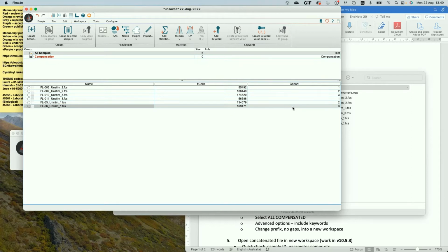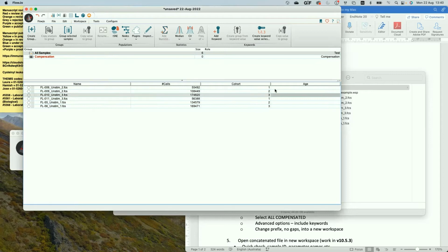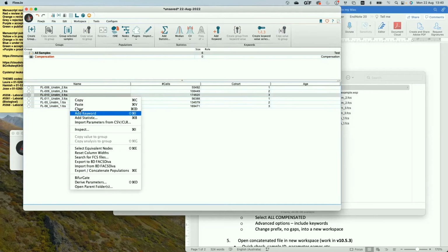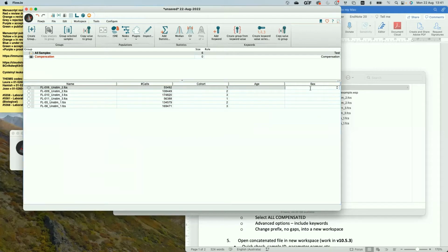So whatever parameter you can think of, convert it to a binary system and put it as a number. Some of these will be easy to do. For example, age, you can just directly put in the age of the participant or the animal. The other ones that you could put in would be, say, sex, and you could have 1 as male, 2 as female. Don't use 0, start with an actual integer.